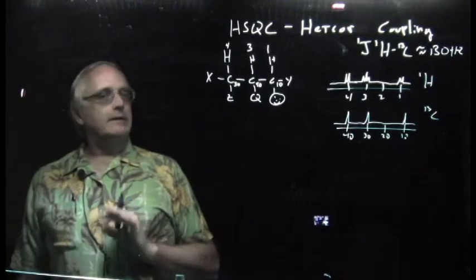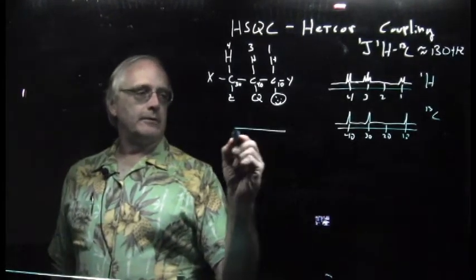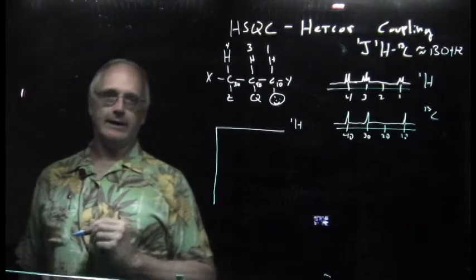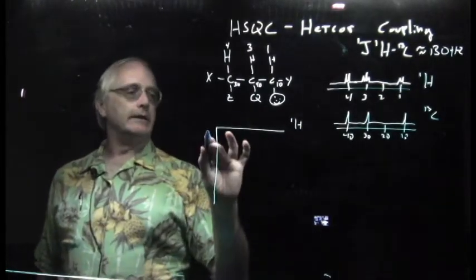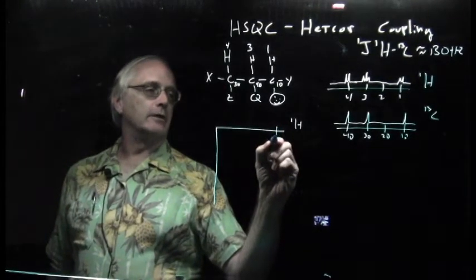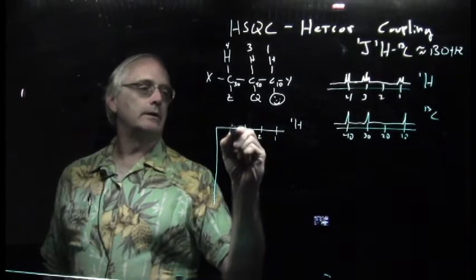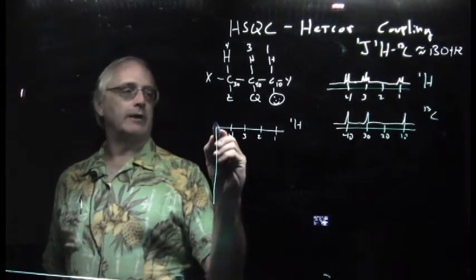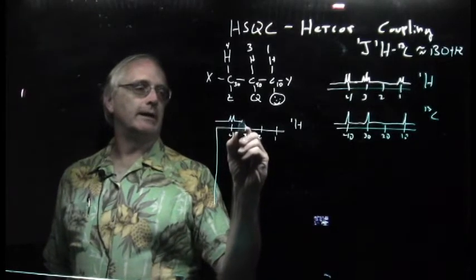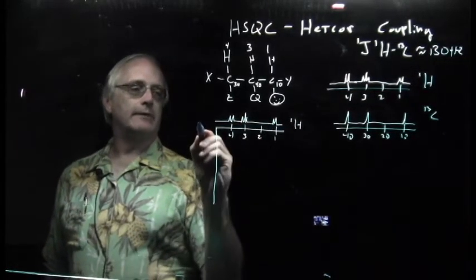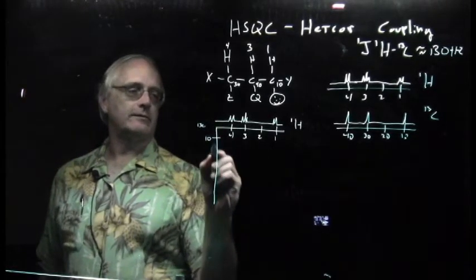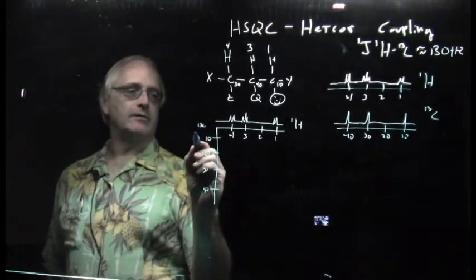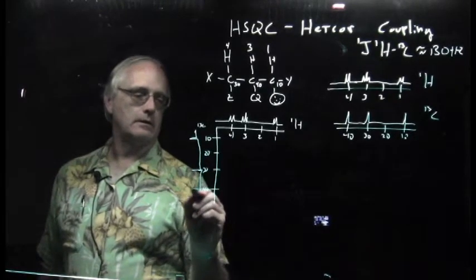Now, the HSQC, the heteronuclear correlation, remember these 2D experiments are characterized by two frequency axes. In our conventional presentation, this is the hydrogen presentation up here on the horizontal axis. And so I am going to put in the numbers here: one, two, three, four. And we see a representation, generally it's called a projection of the proton spectrum. On the vertical axis, we see the carbon 13s: 10, 20, 30, 40. And we see a representation of that spectrum here.